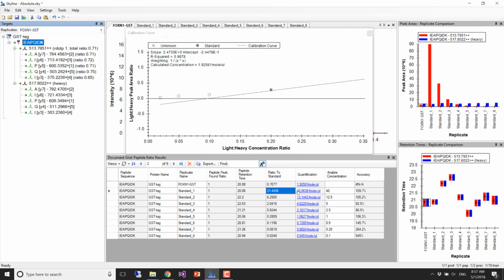And that would be the way, by my understanding, that someone in a lab doing calibration curves would estimate the concentration at this point. So we're pretty far from what our original estimate was, 3.5, just using the really simple approach of injecting a standard at known concentration. All right?